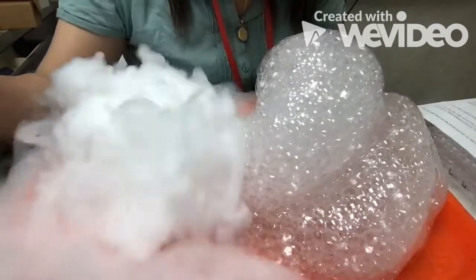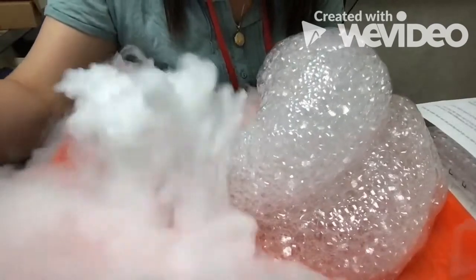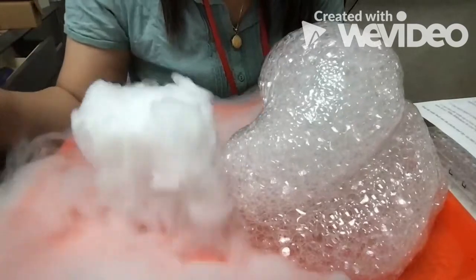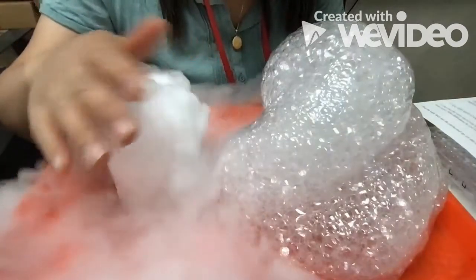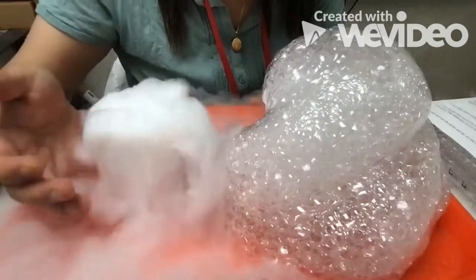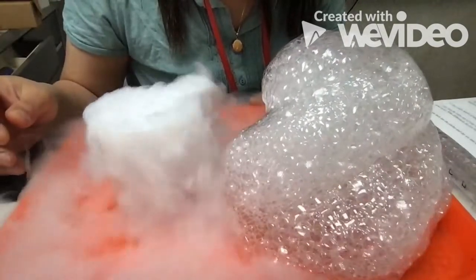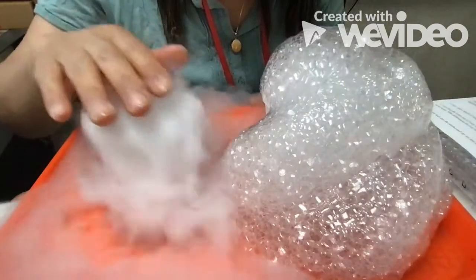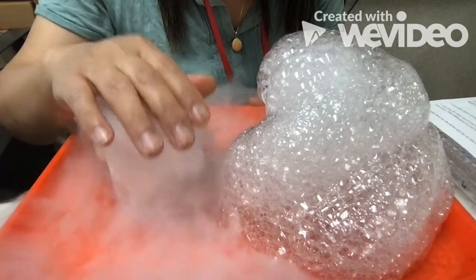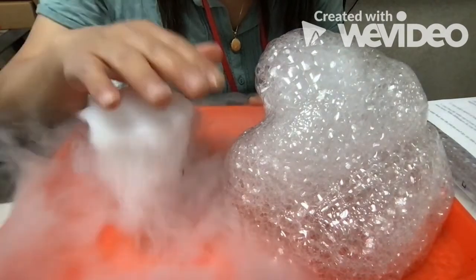Wow, that's really sublimating a lot faster, isn't it? Ooh, I love this. So we can see a nice, this is how you get fog in theater productions and stuff.